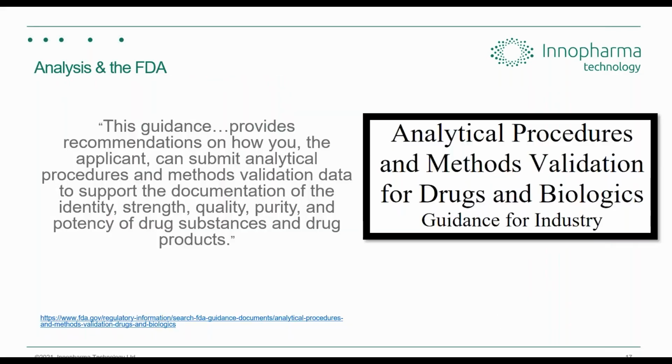All right, moving a little bit on then, just from, let's say, the types of particle size analysis that are out there, the orthogonal methods, and a little bit on from the ways you can actually measure particles. If we actually talk a little bit about guidance documents from the FDA, so we have the analytical procedures and method validation. This might be familiar to some of you, but it's a great document if you haven't seen it. It basically shows a path of how you can take maybe an existing method compared to an orthogonal method to build a case really for bringing that method into your factory.